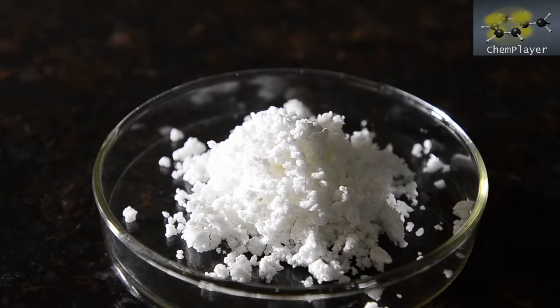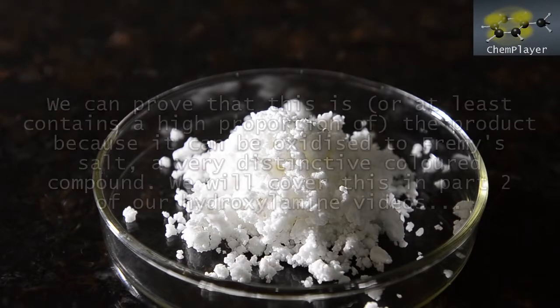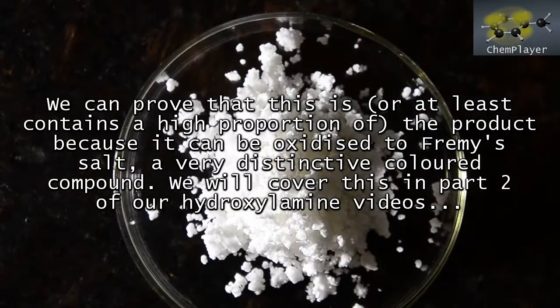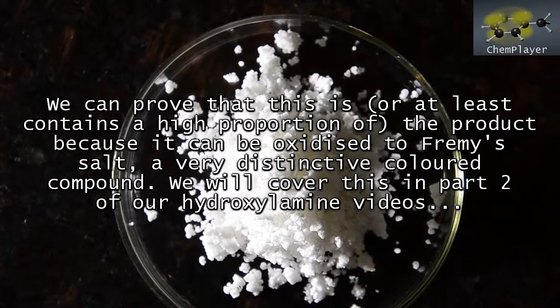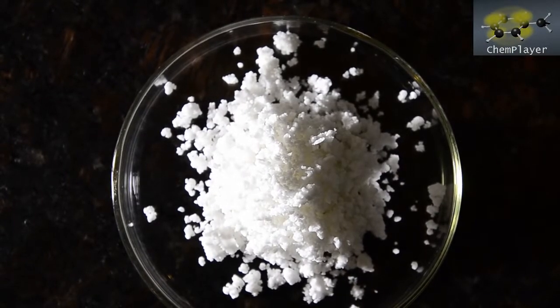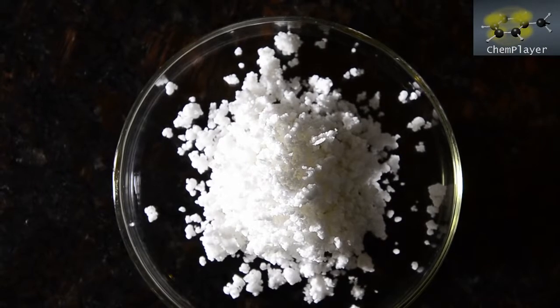We did a couple of experiments which we'll cover in a future video, but we can prove that this has a large amount of potassium hydroxylamine disulfonate in it because it is able to be oxidized to a very distinctive compound called Fremy's salt. So this is finally looking up. Possibly an OTC intermediate to hydroxylamine.